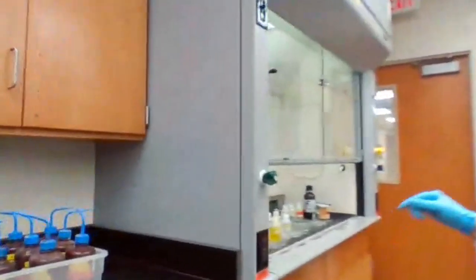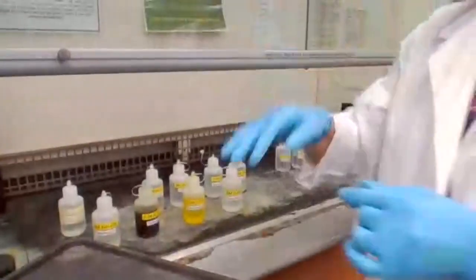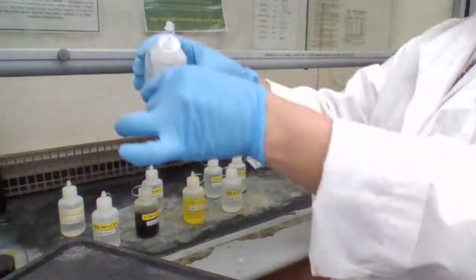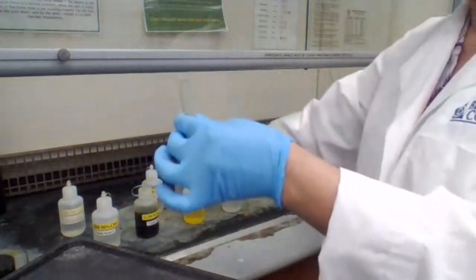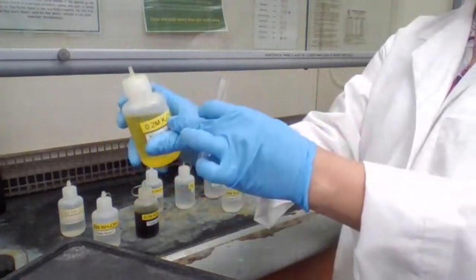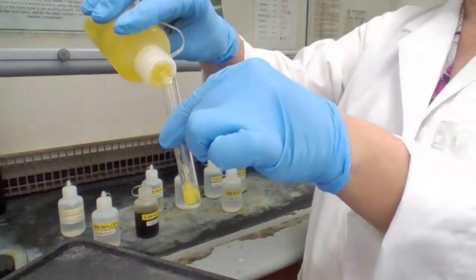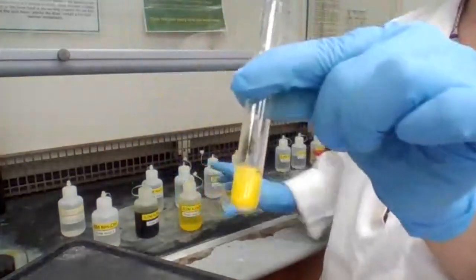So let's go to the fume hood. We keep these in the fume hood because some of them, like high concentration or 6 molar acetic acid, smell very strong like vinegar. So I add 2 drops of acetic acid, and add 5 drops of potassium chromate, this is for part C. See what's happening? A yellow color precipitate forms.